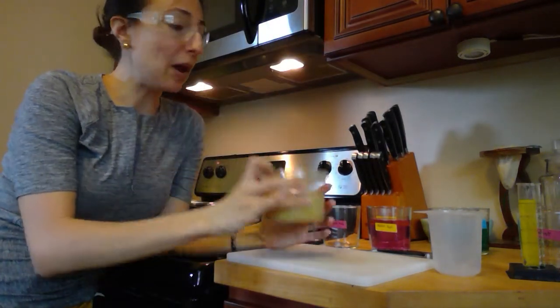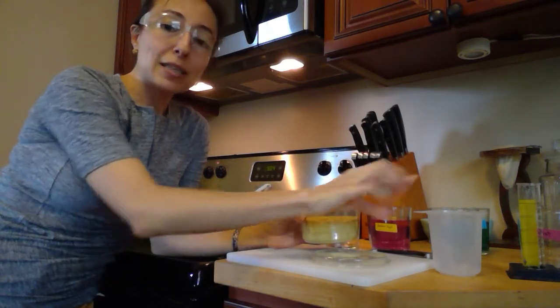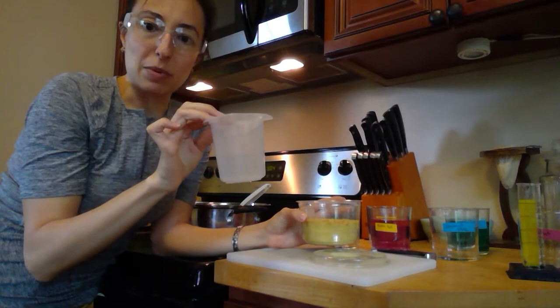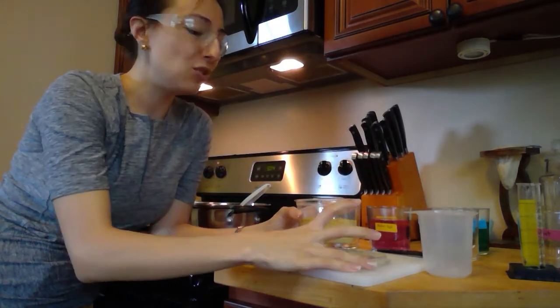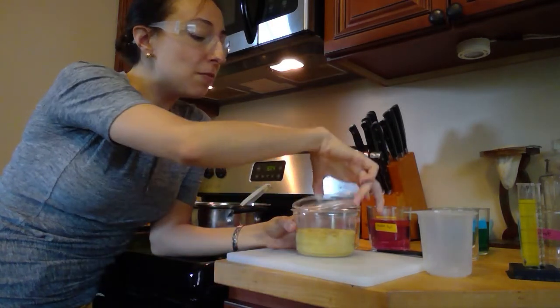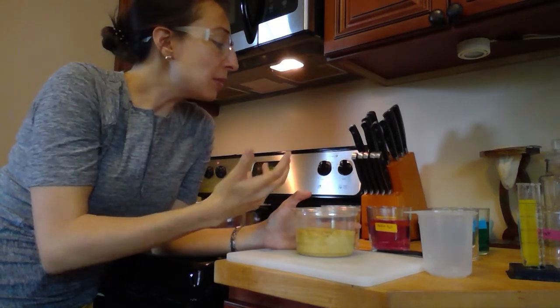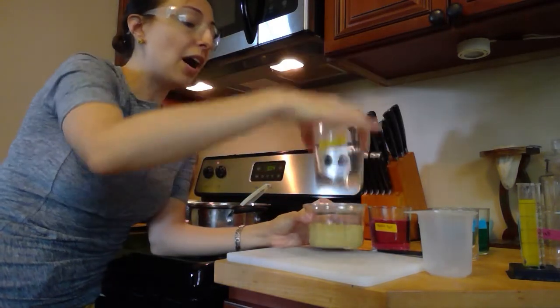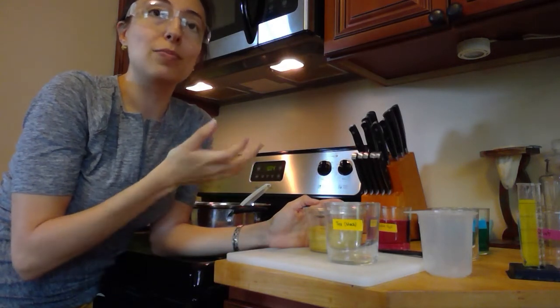And so I'm going to take this powder, and as I mentioned before, if you do use a powder, you're going to add some to your beaker, a few scoops maybe. We don't know how much, right? That's part of the experimentation to see what happens. You shouldn't need a ton, but maybe a few teaspoons, and then you're going to fill it up to the 200 milliliter mark.